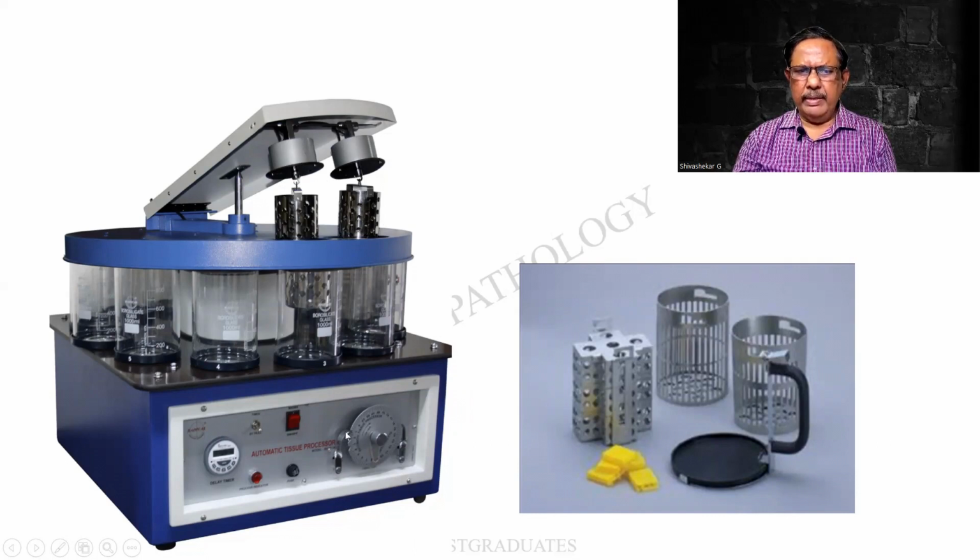Here again, I am seeing the master plate. So this will be niched or notched according to the convenience of the laboratory that is using it. And look at the jars over here. They are somewhat porous, allowing the free flow of fluid from all directions.